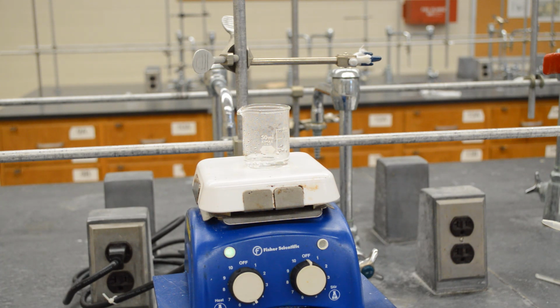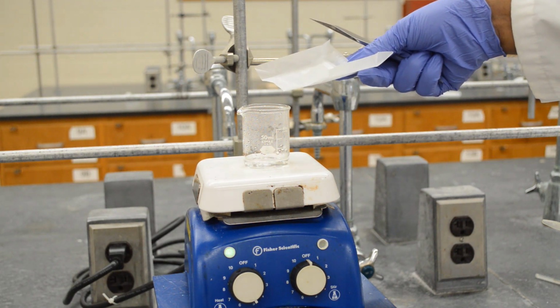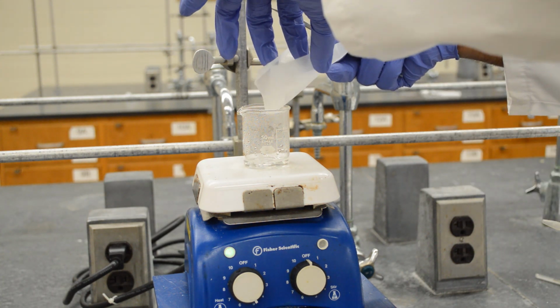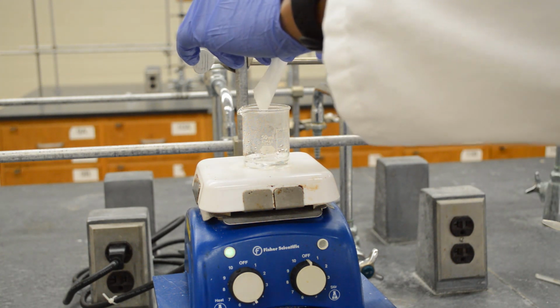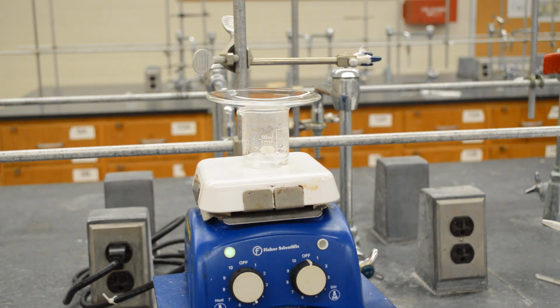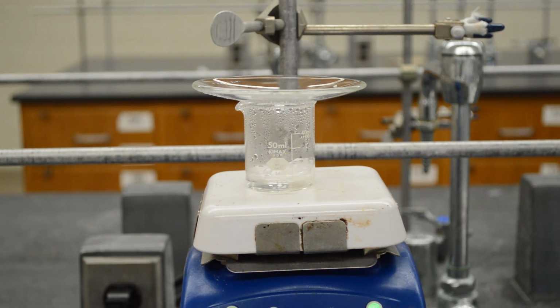The next step is to recrystallize the crude product into a pure one. Add the crude benzoic acid crystals into boiling water. Let it boil to dissolve. Once the crude product is completely dissolved, turn off the heating and let it cool to room temperature before we put that in an ice bath.